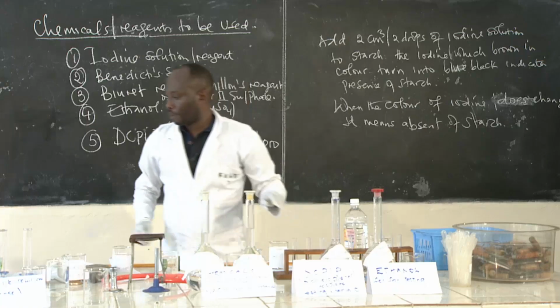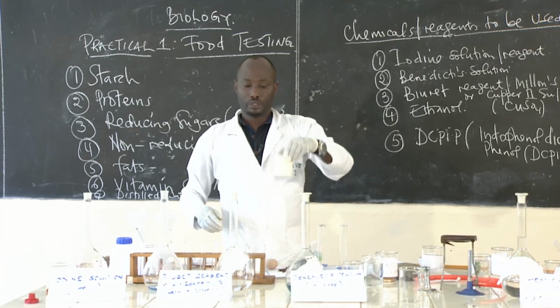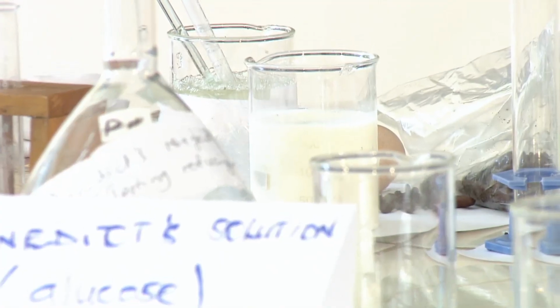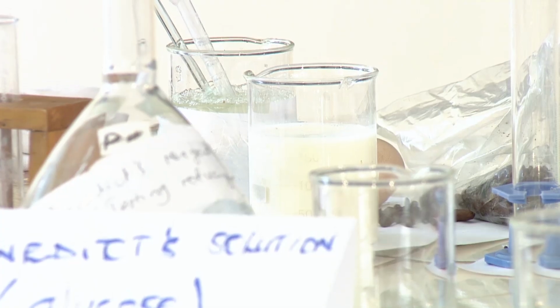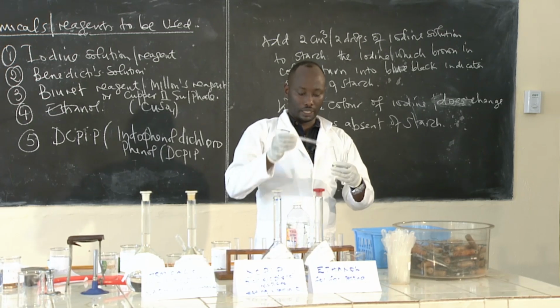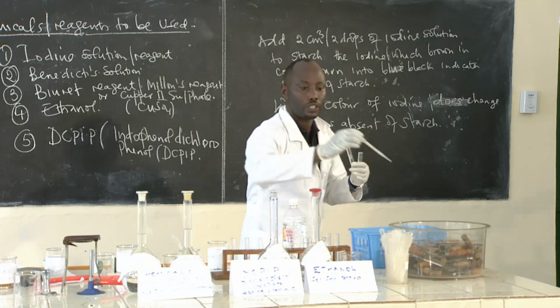So you can take a note about that. Let us also use the milk. Does the milk contain proteins? I will use water as a control experiment, which will test negatively, and then I extract the milk and see if the milk contains proteins.